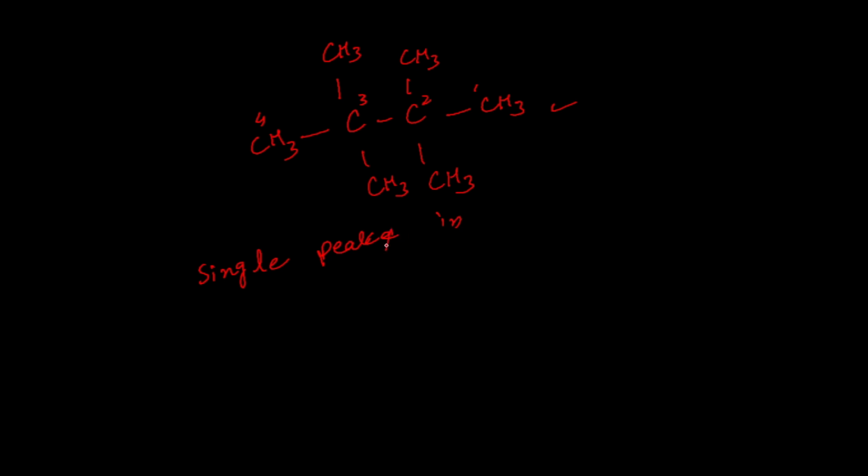in the NMR spectrum. This may be asked in the MCQs.